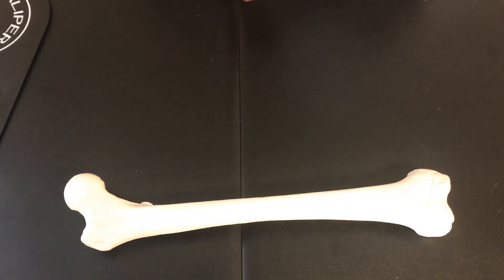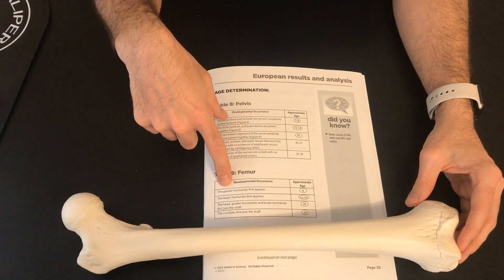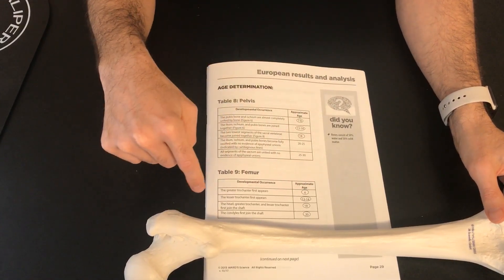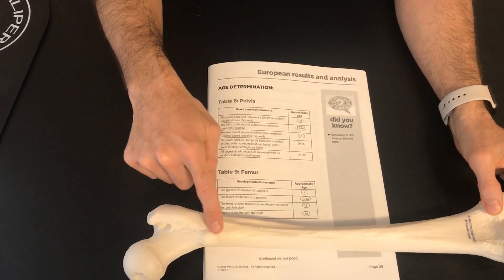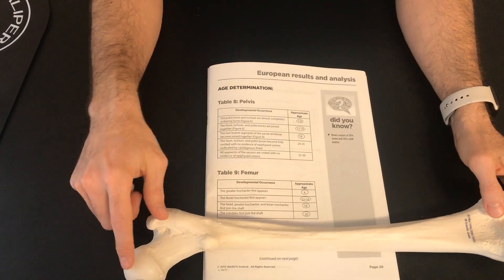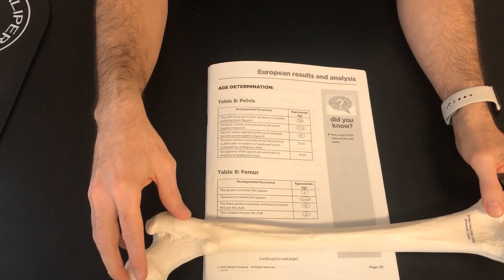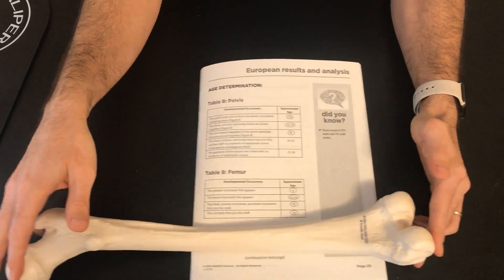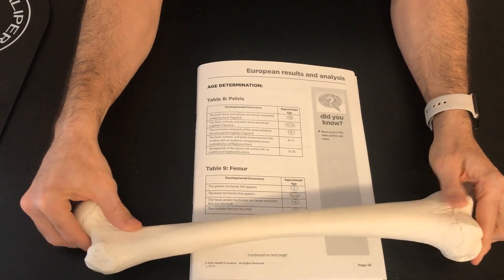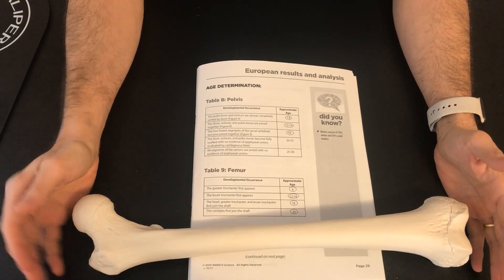The next set of characteristics are for age determination, using table nine that corresponds to the femur. The first characteristic is that the greater trochanter first appears — it has appeared here, so we know the specimen is past age four. Next, the lesser trochanter first appears — that has appeared, so the specimen has passed ages 13 to 14. Then the greater and lesser trochanter first join the shaft — that is the case here, so the specimen has passed age 18. Finally, the condyles first join the shaft — they have joined, so the specimen has passed age 20. That's as far as we can go with age using this bone: the specimen is more than 20 years old. That concludes our femur bone analysis.